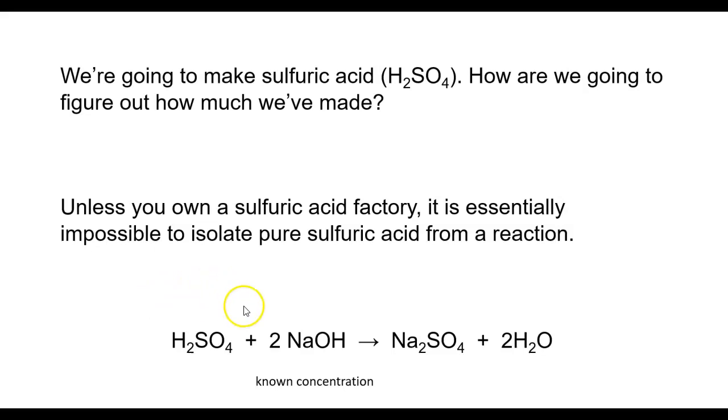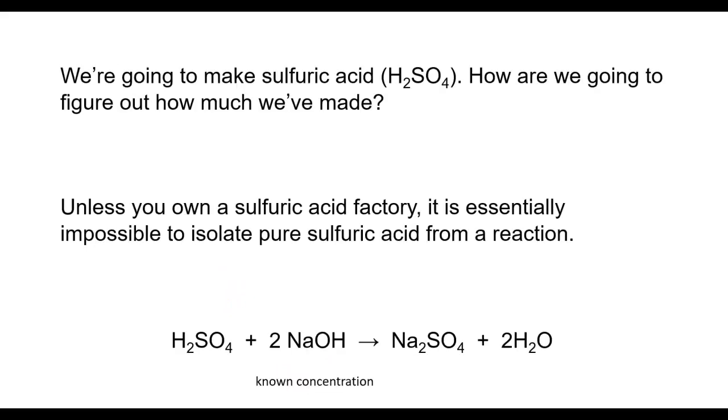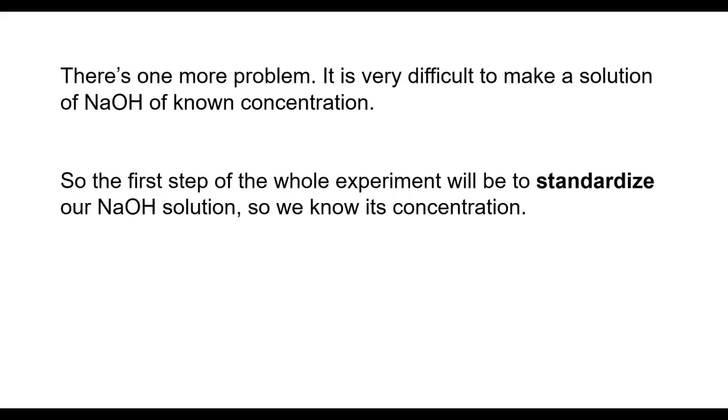So that sounds good, but there's one more problem, and that is it's really difficult to make a solution of sodium hydroxide of known concentration. I've said here, this works if you know the concentration of your sodium hydroxide. It's really hard to make a sodium hydroxide solution of known concentration. And so what you have to do is make a solution of sodium hydroxide and then try and figure out what its concentration is. To do that, we're going to use a process known as standardization, in which we're going to use a known quantity of another acid to react with the sodium hydroxide to figure out its concentration.